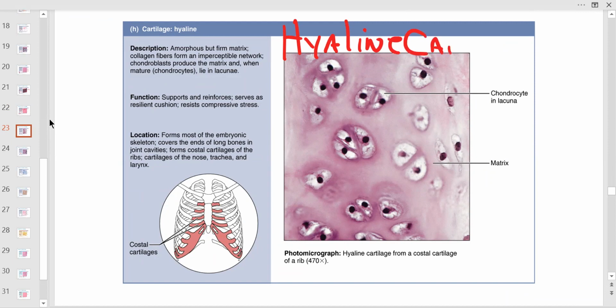Cartilage now. I'm saying cartilage. Emily, you with me? Not just CT. It's just cartilage. It is connective tissue, though. So this is under connective tissue because, look at this, collagen. This is just thick ground substance, all collagen. And this is really important.